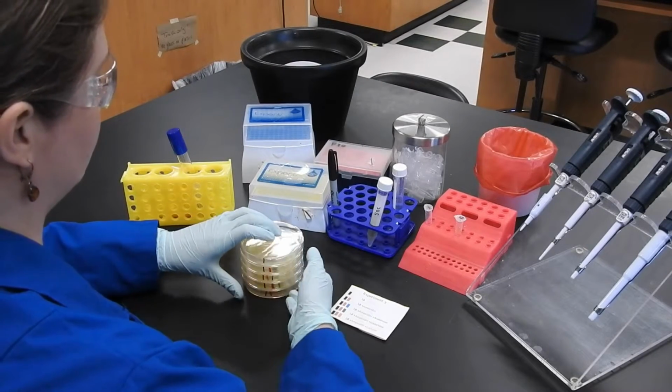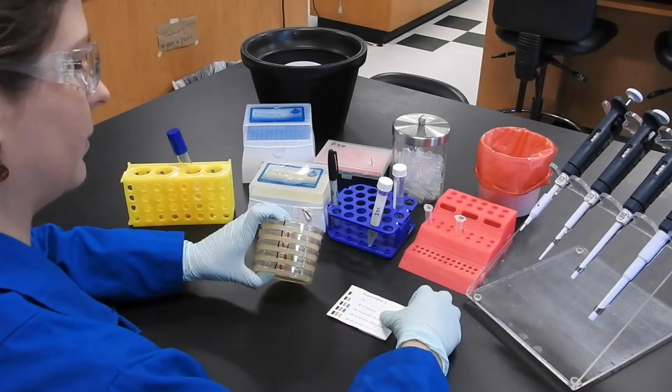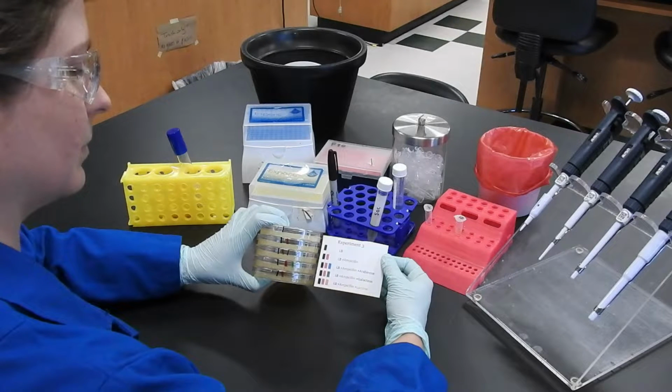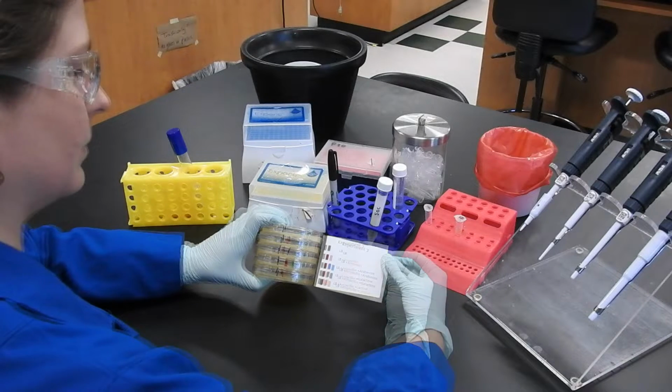There are 5 plates for this experiment. They are labeled with different colored stripes. One black stripe indicates the media is LB with nothing else added. A red stripe indicates ampicillin was added. The sugars added are indicated by the blue stripe for arabinose, the green stripe for galactose, and the orange stripe for lactose. These are the 3 sugars that can activate gene promoters.